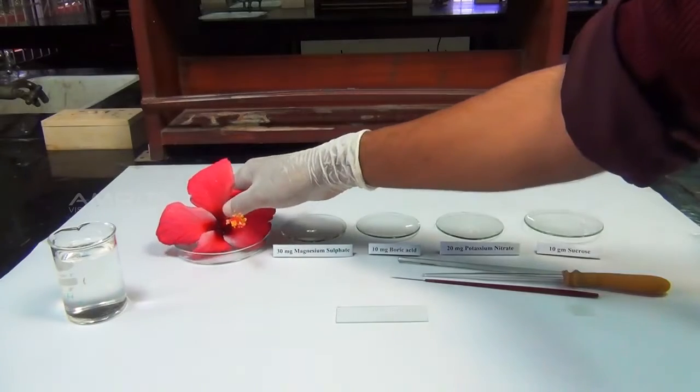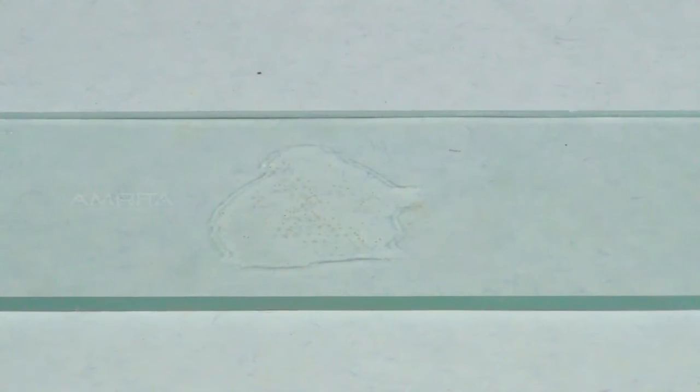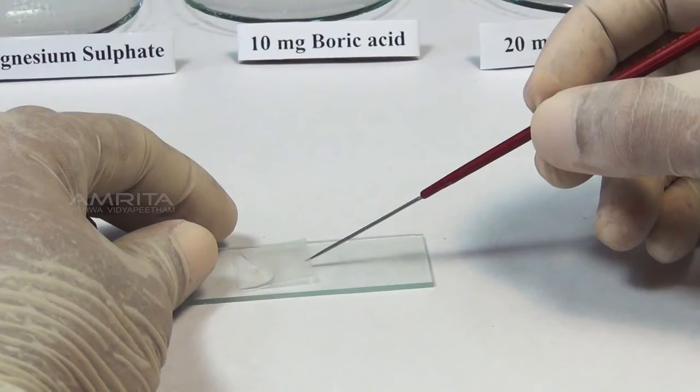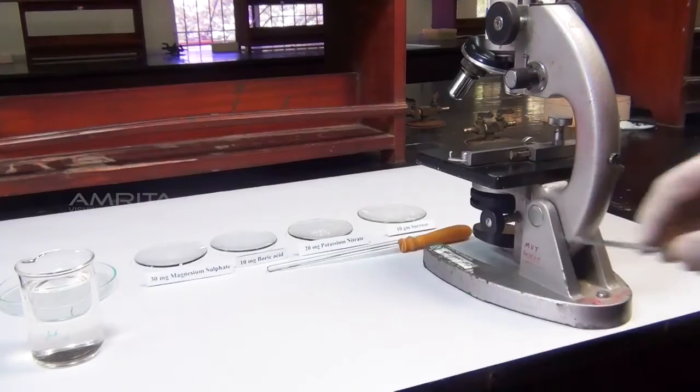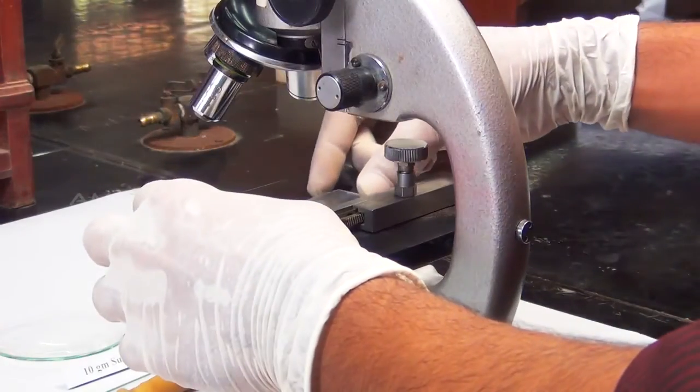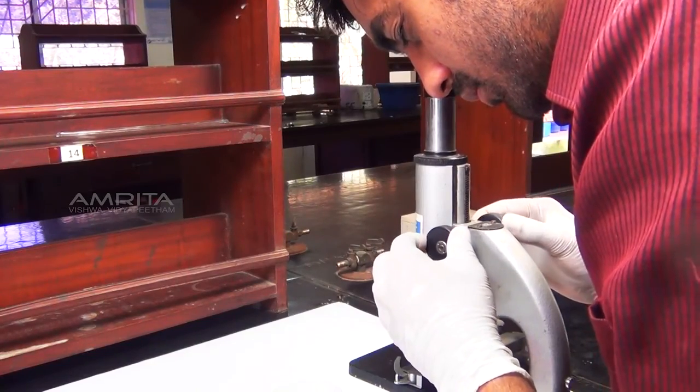Take a mature flower and dust a few pollen grains from its stamen to the drop on the slide. Place a cover slip over the drop on the slide using a needle. Place the slide on the stage of the compound microscope. After 5 minutes, observe the slide through the microscope.